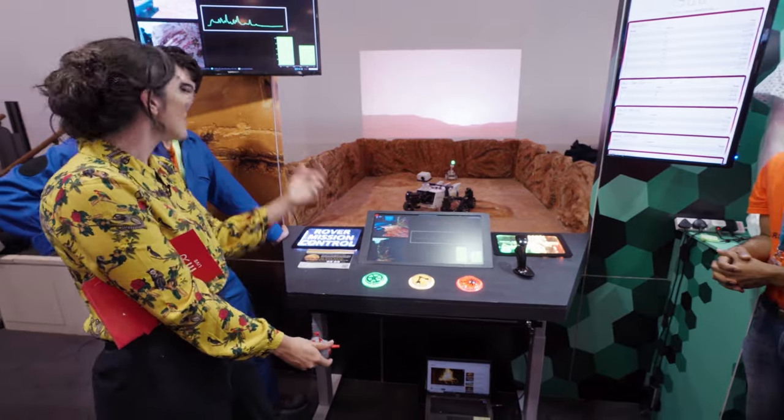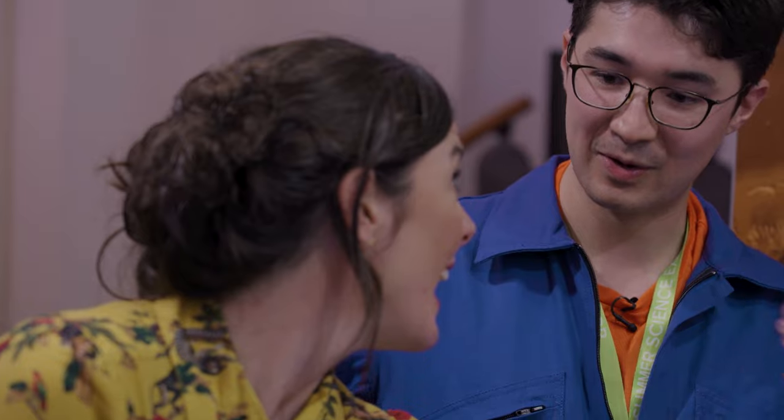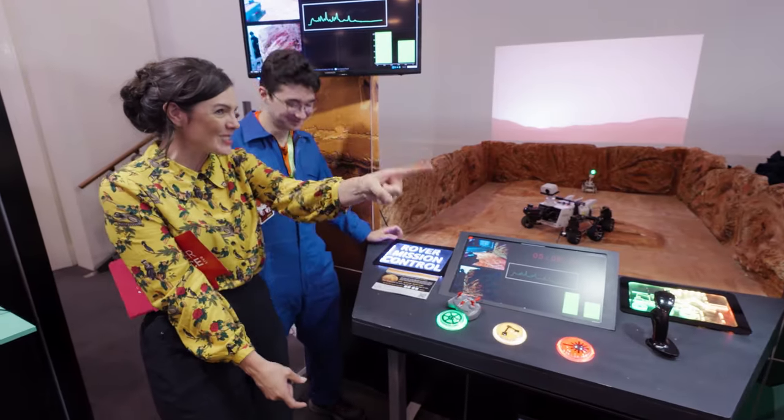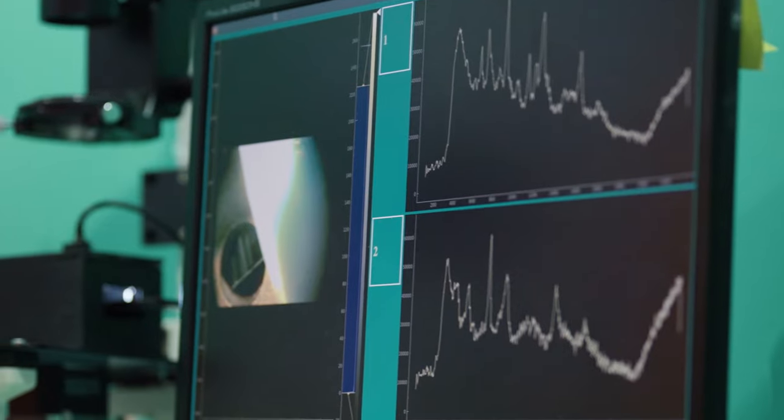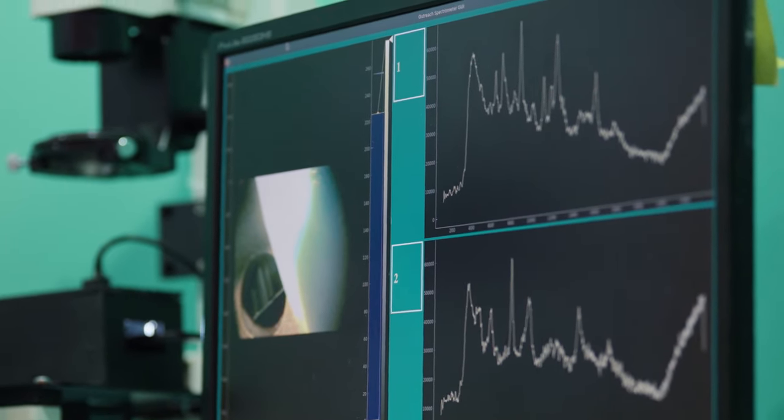And it brings up the chemical fingerprint. And this is Raman spectroscopy, giving us a unique identifier, telling us whether there's evidence of past microbial life. Brilliant. And then you're using this to draw on people's imaginations and entice them in. But the research that you're doing is over here, isn't it, Sumit? Absolutely.